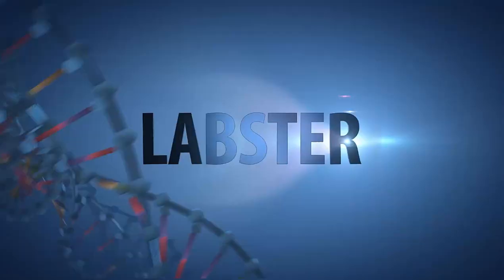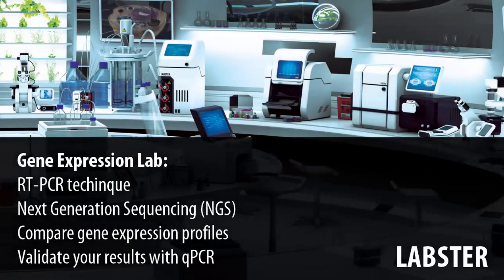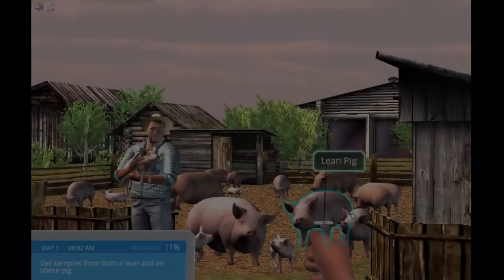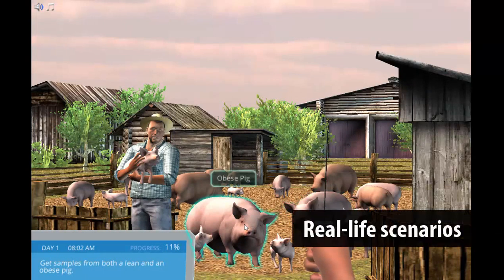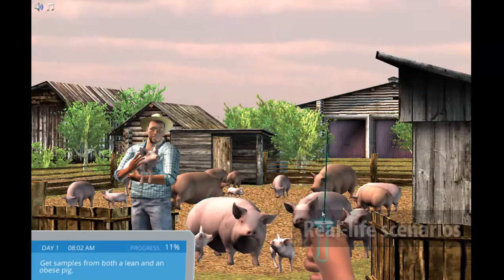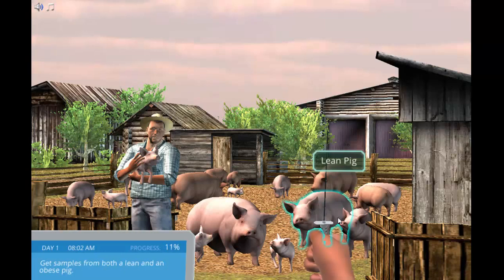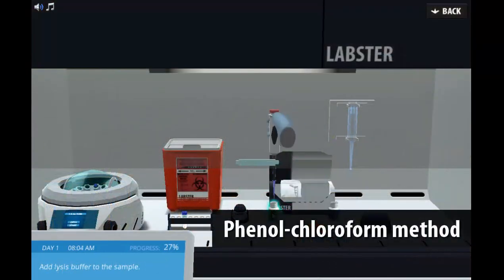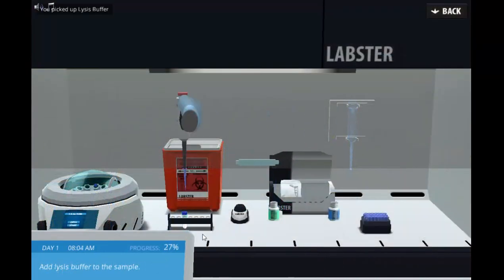Welcome to the Gene Expression Lab, where students will be part of a research team investigating genes related to obesity. In order to study obesity, students arrive to a farm and collect fat samples from lean and obese pigs, then extract the RNA using the phenochloroform method.